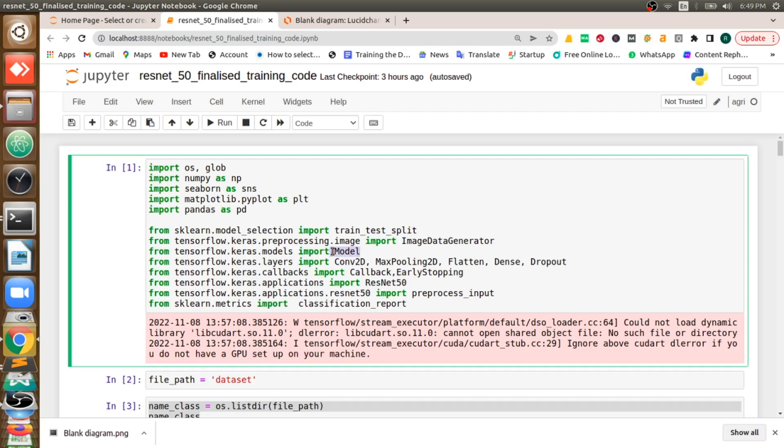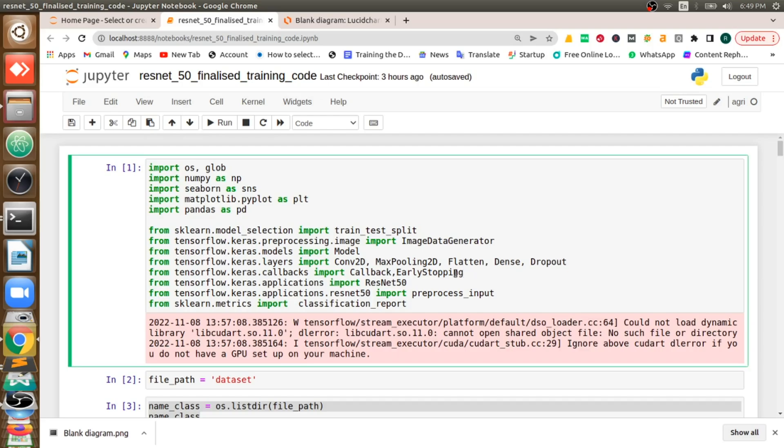So all these things can be done with ImageDataGenerator. Model is used to build the model from the layers and these are all the layers. Deep learning models are neural networks, what we say, neural network layers. And I will tell you now what is the early stopping. When it comes I will let you know all these things.